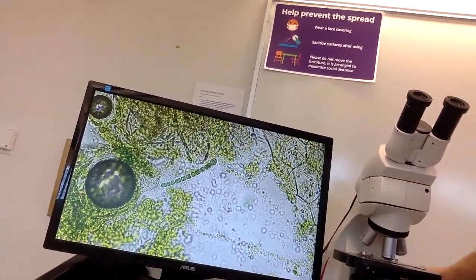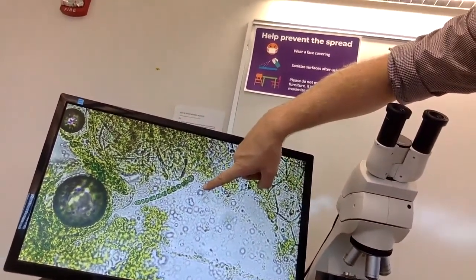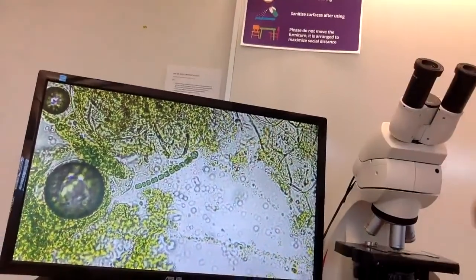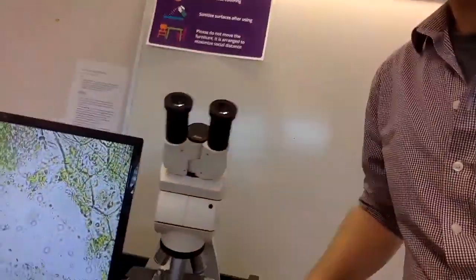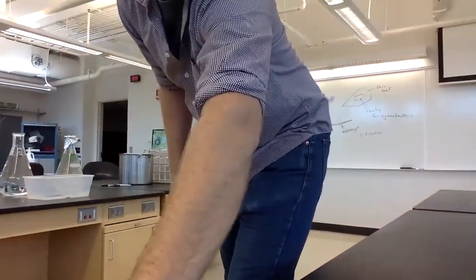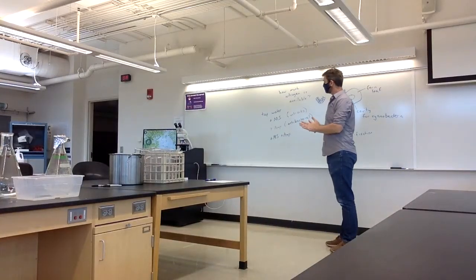You can also see, oh, so cute. So we're definitely not a sterile environment. There's a little like euglenid or something in there. These little jiggly bits in there would be organisms that are associated and kind of swimming around in the medium. So we're gonna sort of take that as fine and hope to change or see an effect based on what we change and not an effect based on all that.